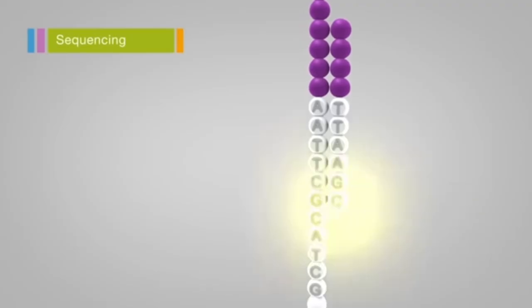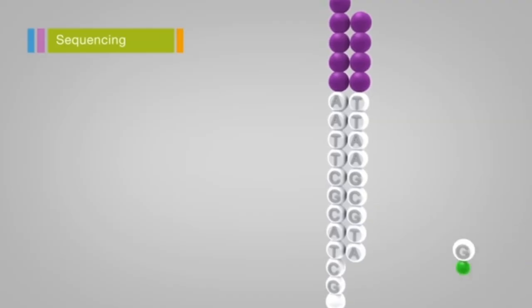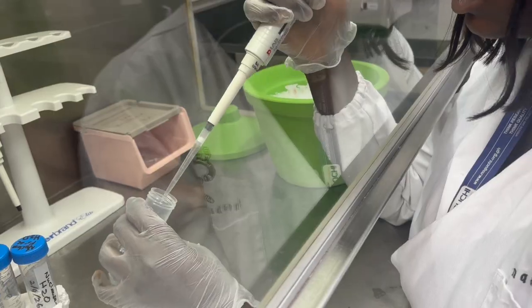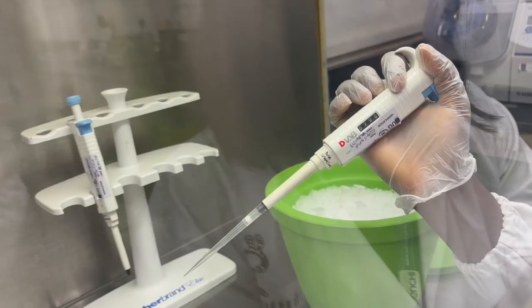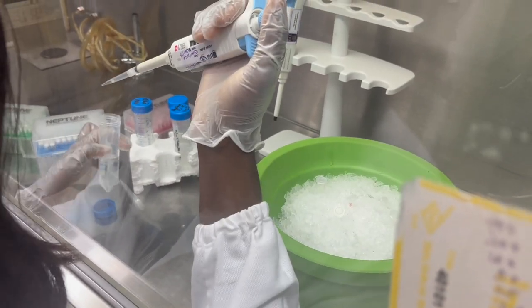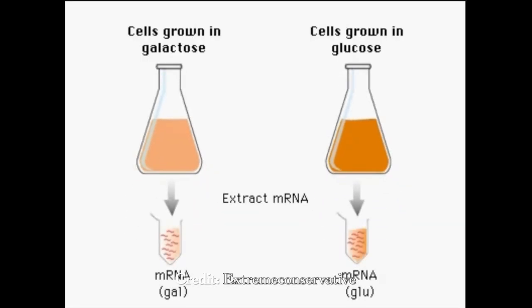And then you come to RNA sequencing, you can even measure the expression of all genes that are expressed in a certain organism. But as you can appreciate, with the expansion of data that you can collect, so not just one gene or a handful of genes, if you want to go to thousands, or if you want to do the whole genome, then that is accompanied by costs, usually higher costs. So that's how these techniques track. Does that make sense? Okay, so let's look at some deeper details about each of these.